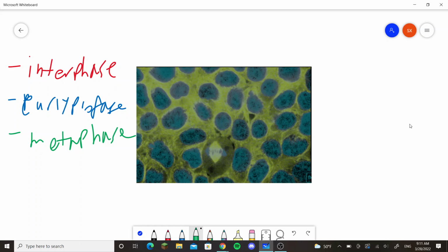So today we're going to be identifying the stages of mitosis using the generously given Allen Cell mitosis cell identification practice kit. Essentially, what we have here is an image provided by the Allen Cell Lab, and we're going to be identifying interphase, early prophase, late prophase, metaphase, anaphase, and telophase and cytokinesis.